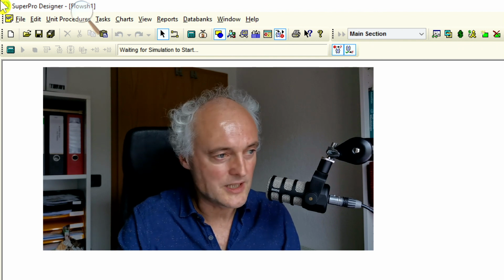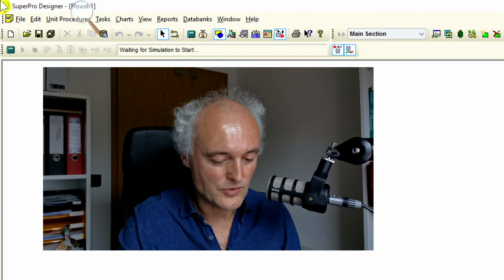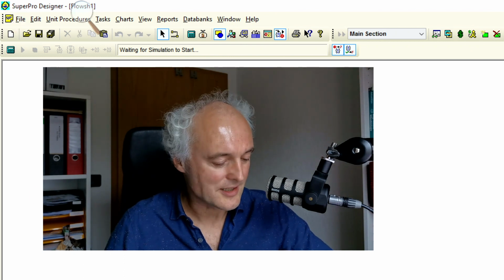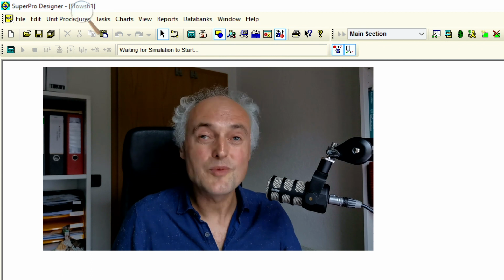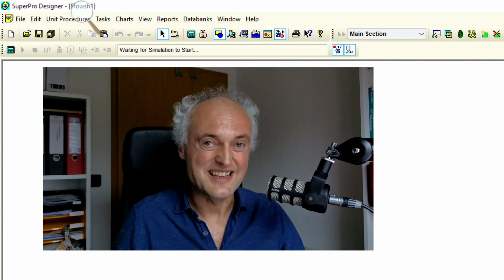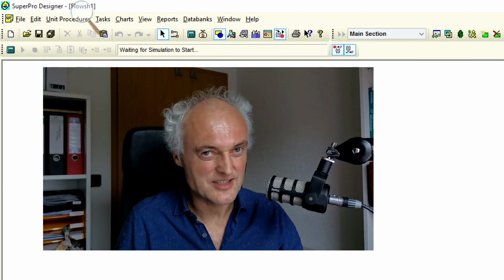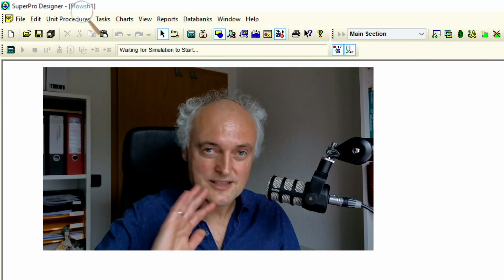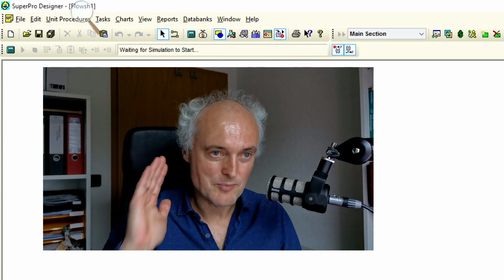Now it should be a bit easier to see for you. Okay, now here we go. Now let's start. I know that you didn't really have the time to read it because I was a bit late to tell you. It's a good idea to have a look inside of it. It doesn't matter. We go through it step by step.